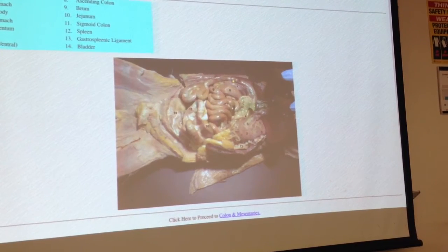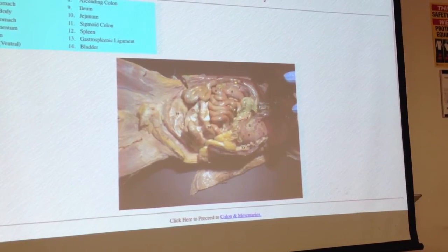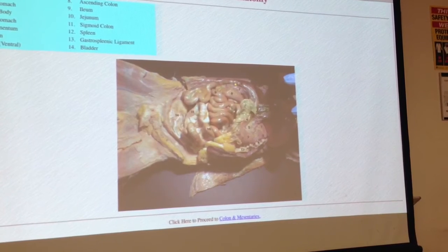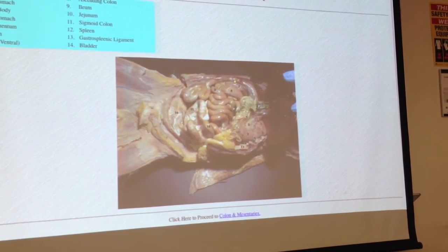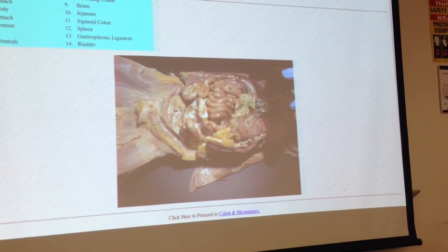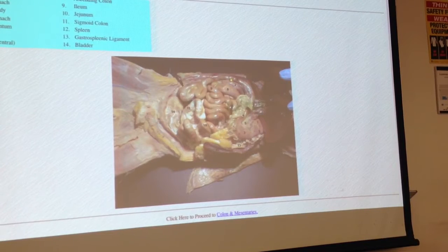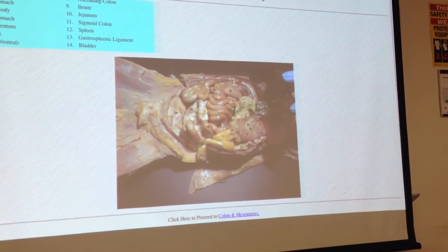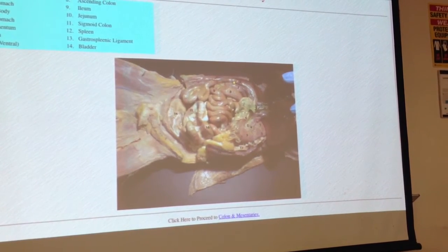And as you can see here, see all this fat tissue attached to the larger crest of the stomach? All of that is the greater omentum. You don't need to know that this is the larger crest, but it's helpful to note that. Basically in your C, you have the outside big C and the inside little c. The outside is where the greater omentum attaches. And then right here, in the center of the C, that fat that you'll see is the lesser omentum. It's tucked right in there.